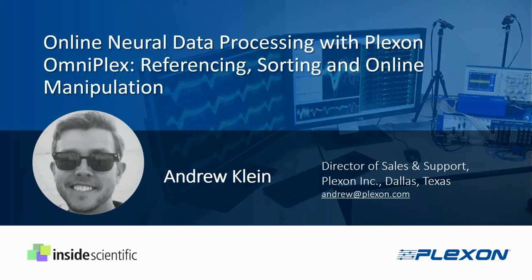The majority of today's webinar will be spent in OmniPlex software, where Andrew will be showing various functions and features of OmniPlex, including how to optimize signal quality, and how to approach data analysis using multifunction layouts, thresholding tools, data referencing options, and spike sorting functions.